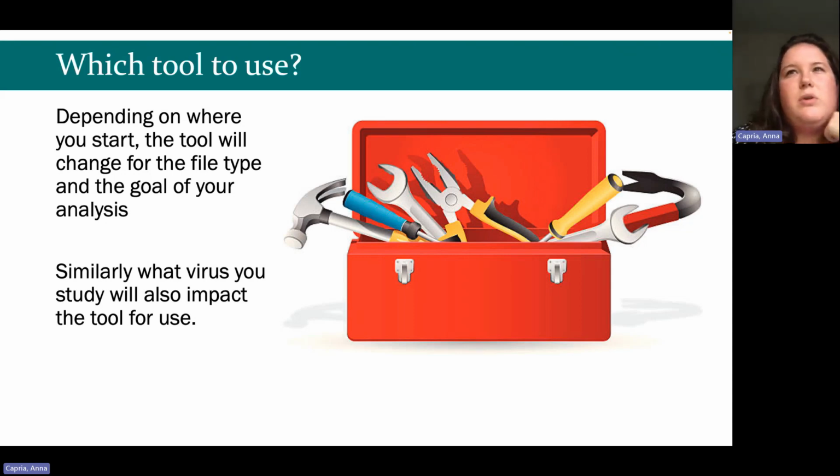That's when it's really important to come to the BV-BRC with a question, and that will guide what data you're using and then subsequently what tool you might want to use for your analysis. Similar to studying a specific virus, the tool that you use will impact your analysis.